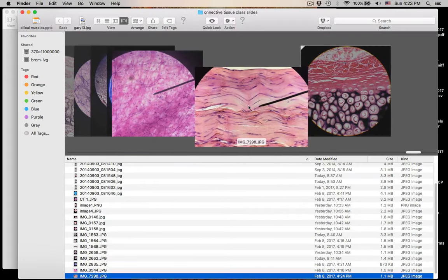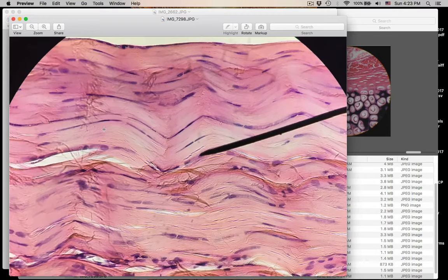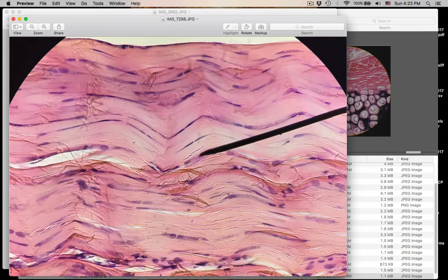Number twenty-four is dense regular. The collagen protein fibers are arranged in a parallel fashion. Dense regular connective tissue proper — dense because the protein fibers almost fill up the whole matrix. Collagen fibers. Dense regular connective tissue proper.